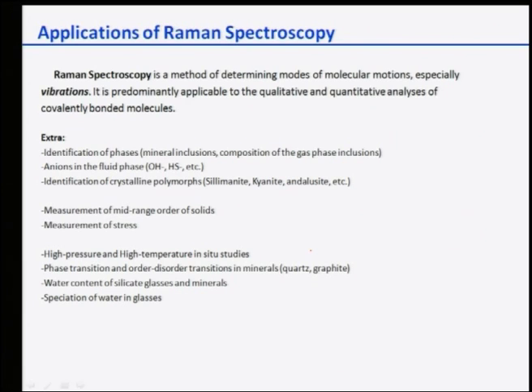Applications: Raman spectra can be used for many applications like molecular vibrations or qualitative and quantitative analysis. It can be done for all kinds of elements, mid-range solids, stress measurements, high pressure, and glasses also. There are a large number of applications. So with this I close this chapter on Raman spectroscopy. The only thing left over is the STEM EELS, electron energy loss spectroscopy, which we will discuss in the next two classes.